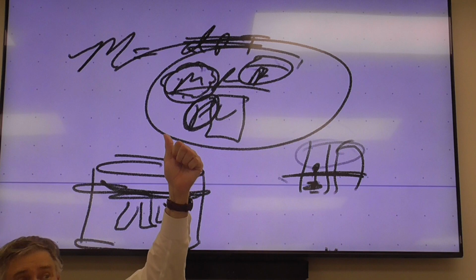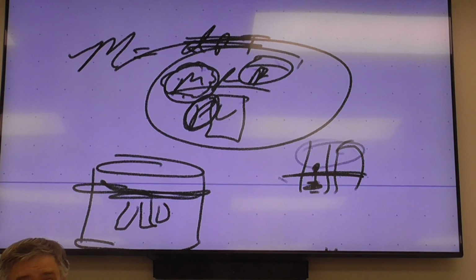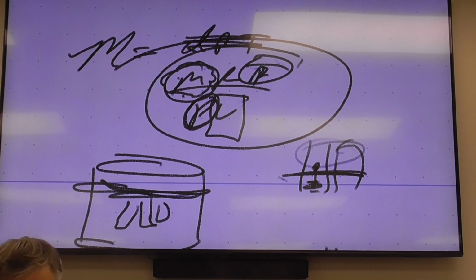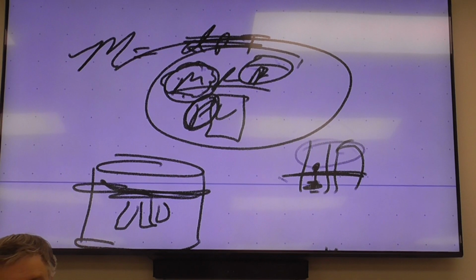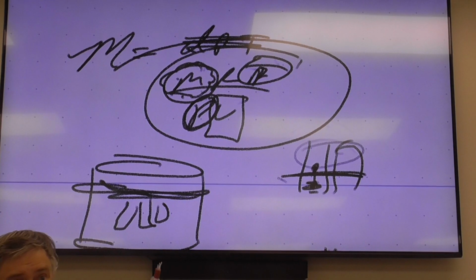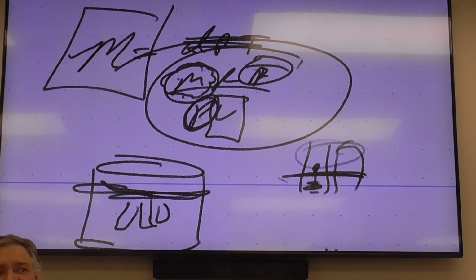At that point, we're going to know the mass of the gas in there. That is not the mass of the water. That's the mass of the volatile liquid. You know the ideal gas law constant. You know the temperature of the water. Make sure the temperature is in what units? Kelvin. I'll give you the pressure. I'll look at what that is. And then at that point, you're going to know the volume of the pipette. From there, you can try and figure out the molar mass.